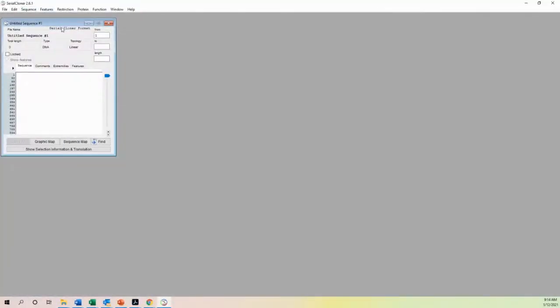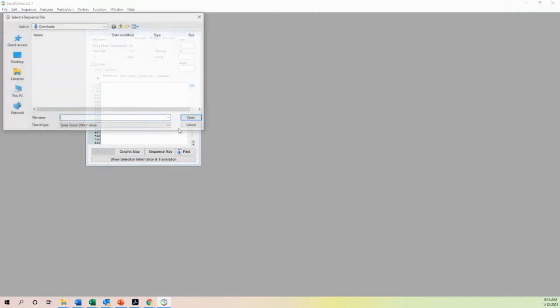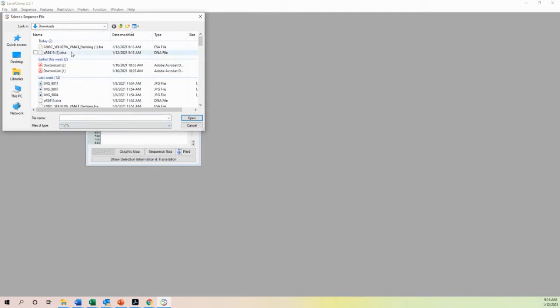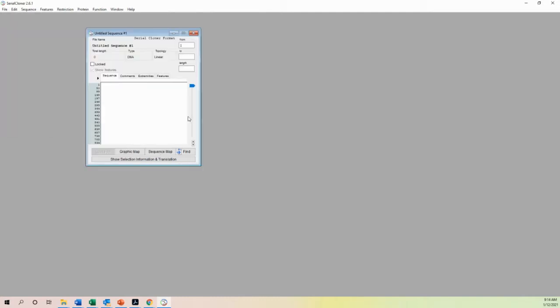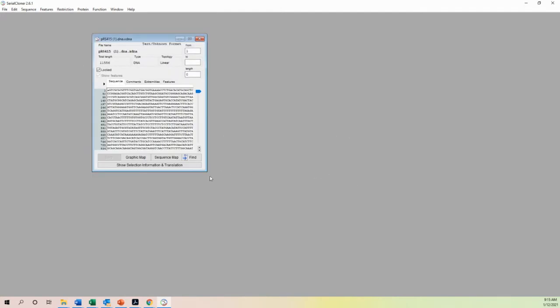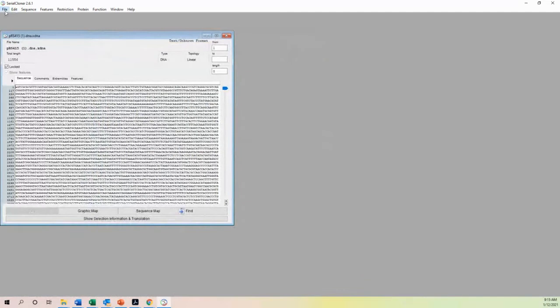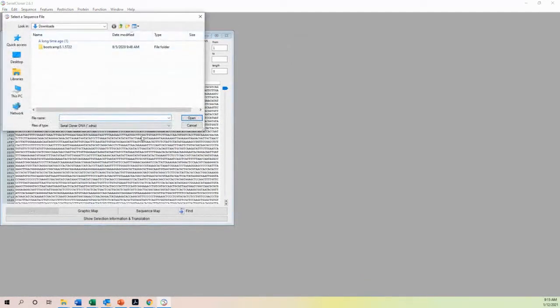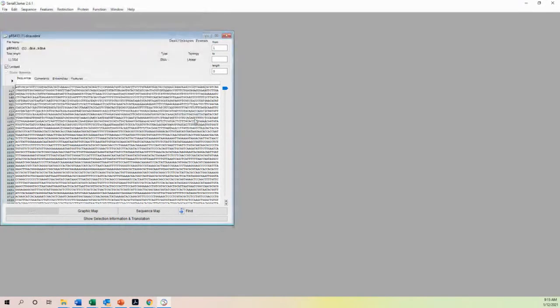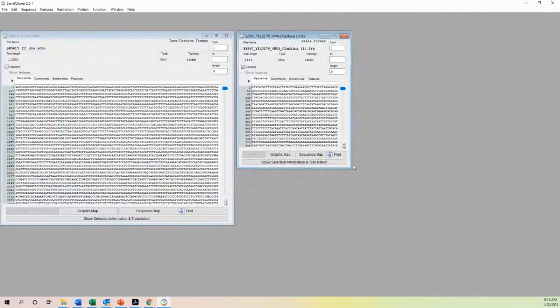First of all, let's open up the PRS 415. So we have PRS 415 available now. And then we open the VMA3. So now we have 2 files available.